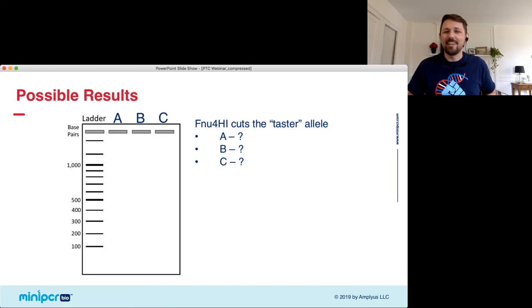We're going to put our DNA in the well up here, and a charge is going to pull it down. And in each one of these wells, remember, we're putting billions of pieces of DNA. So it's billions of pieces being pulled through this, and how far they go depends on how big the DNA is. But they run all in the same size and shape, similar to what this is called a band. So it looks something like this.